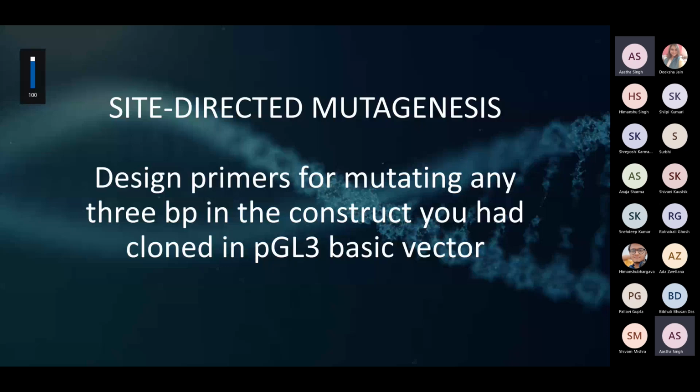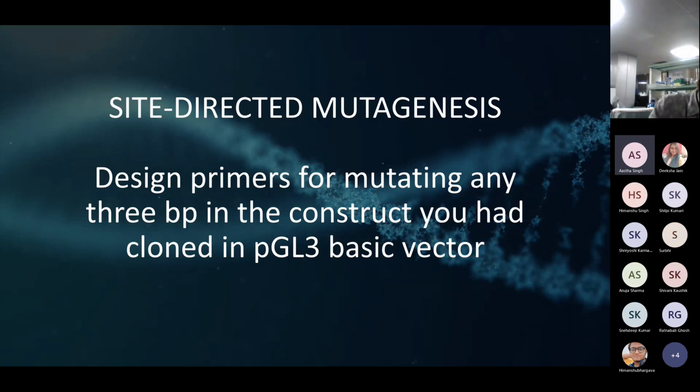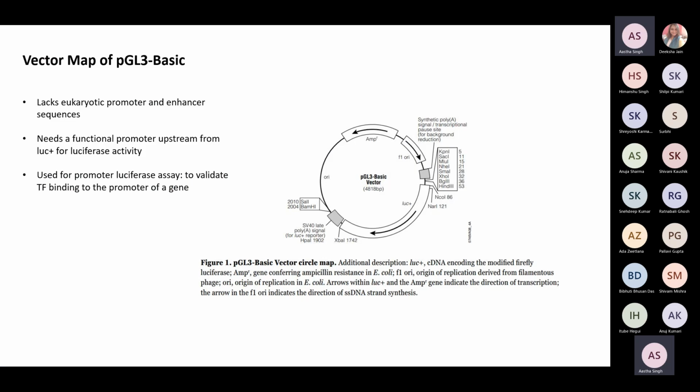Hello and welcome, students. My name is Indranil and today I'm going to teach you how to design primers for mutating a few nucleotides in a sequence that we have cloned in PGL3 basic vector. So let's move on to the first slide.